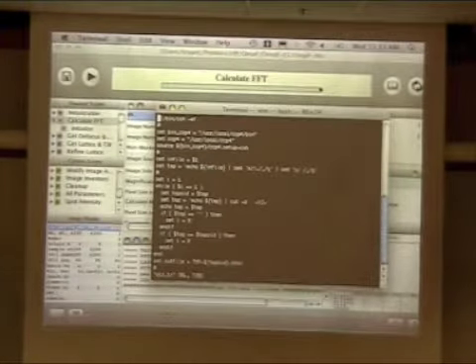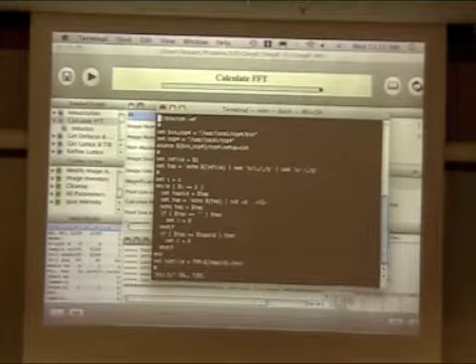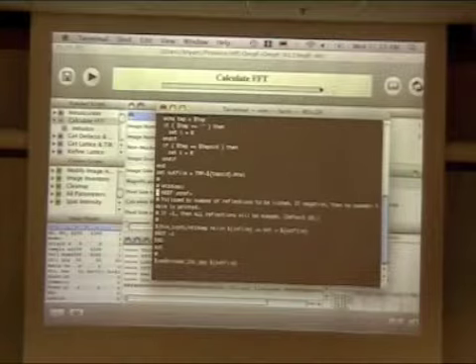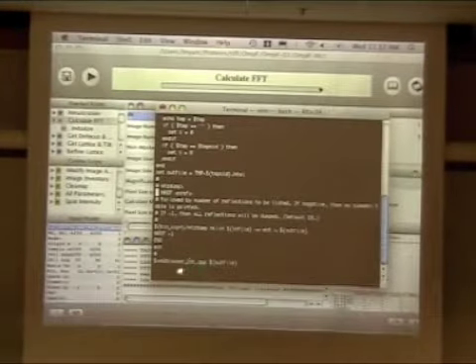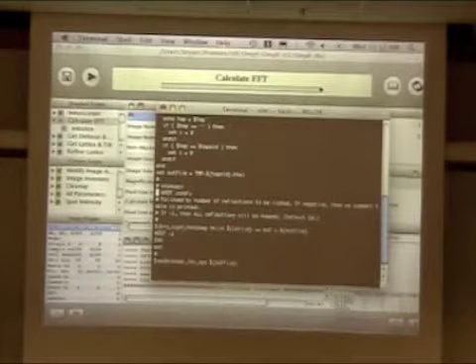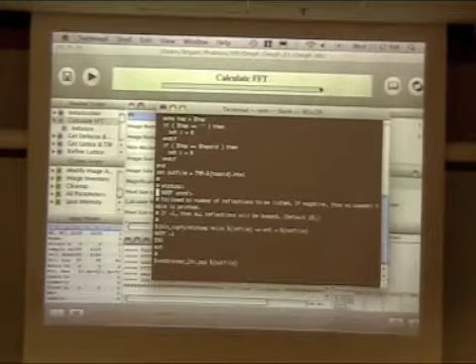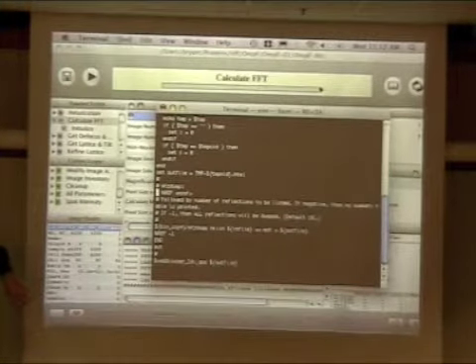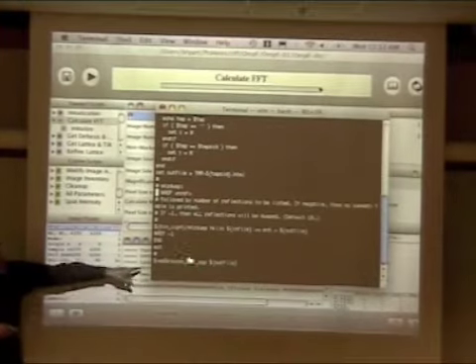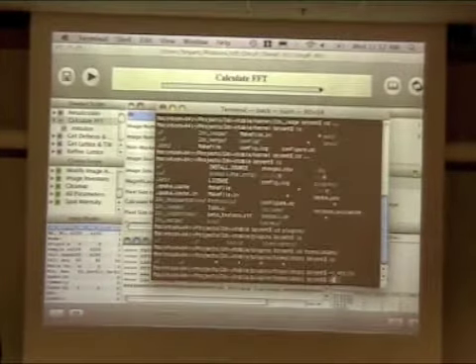And it takes advantage of one reserved word, which is going to be down here at the bottom, which is application name underscore 2dx underscore app, and then the out file. And the out file is whatever you define here. So basically what this does is it uncompresses our MTZ, does a few things in terms of formatting, and then uses the web browser to open it up. And the web browser is defined, again, here.